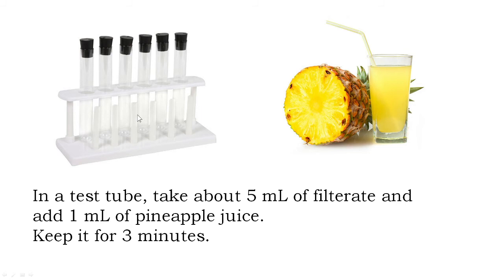After that, in a test tube, you take about 5 ml of the filtrate and add about 1 ml of fresh pineapple juice. Keep the mixture for about three minutes.